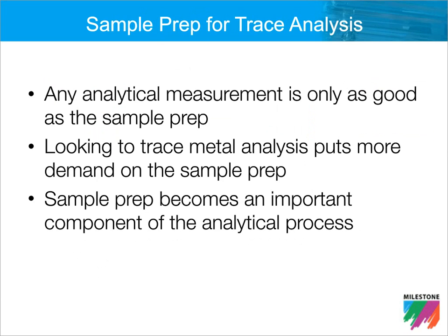Now, really the adage garbage in equals garbage out applies for sample prep, because any analytical measurement is only as good as the sample prep. The ICP or the ICP-MS is only going to tell you what is in the sample that you put in front of it. Because of regulations, R&D needs, et cetera, the demand for lower and lower detection limits is increasing. And so sample prep is becoming an even greater component of the analytical process.